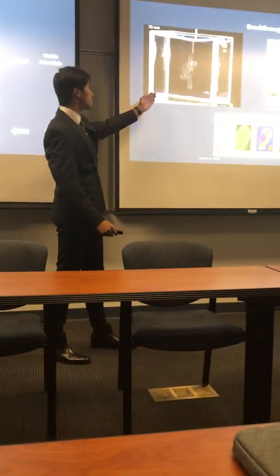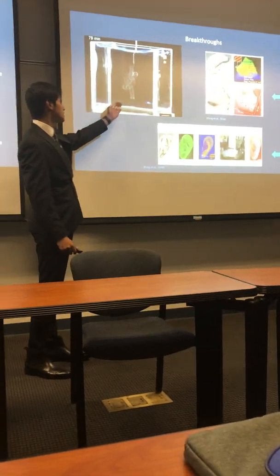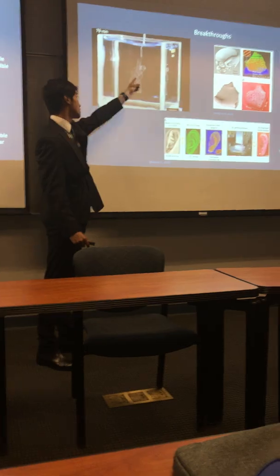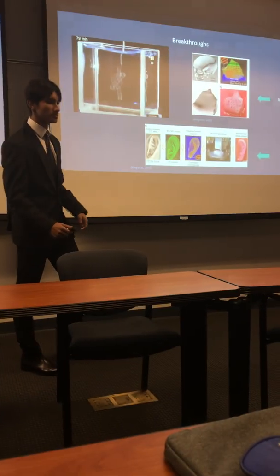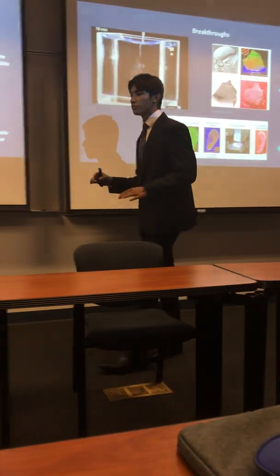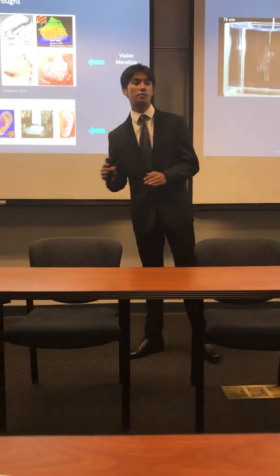In this picture here, we see a 3D bioprinted knot. This just shows you the different types of complexity of curvatures that we can create. You might know 3D bioprinting because something revolutionary can happen. We could 3D print organs.